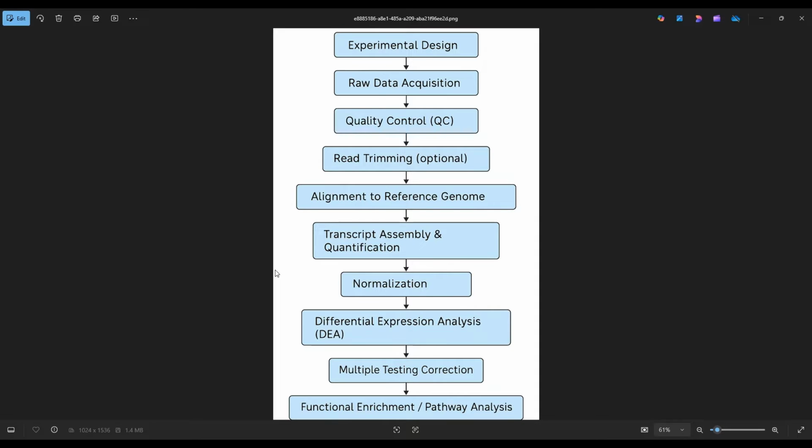So you need the sequencing data from different cancer samples, and then you need the sequencing data of a normal sample, and those files will be raw files, and that is the FASTQ file. Those FASTQ files would be of the cancer genomes, and the normal transcriptomes of normal genomes.